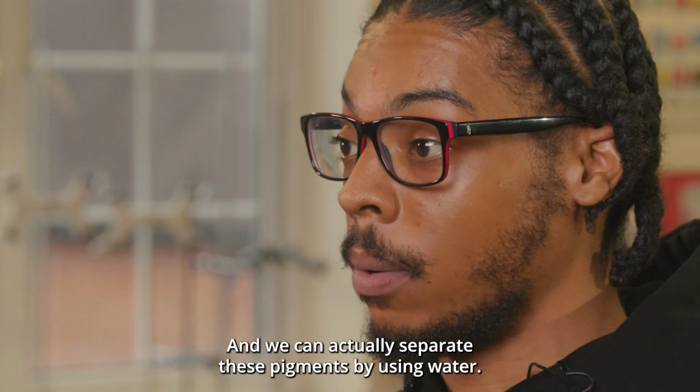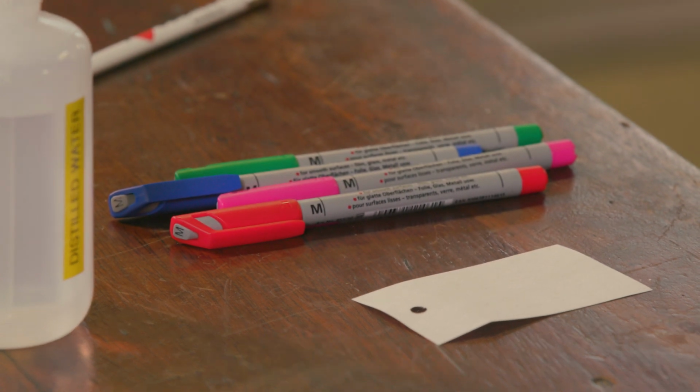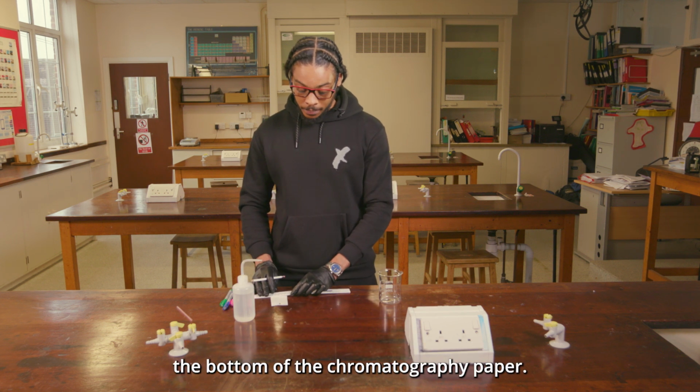pigments by using water. Okay, so what we're going to do now is prepare the chromatography paper so that we can separate the ink into its different pigments. Right, so the first thing that we're going to do is draw a line in pencil towards the bottom of the chromatography paper.